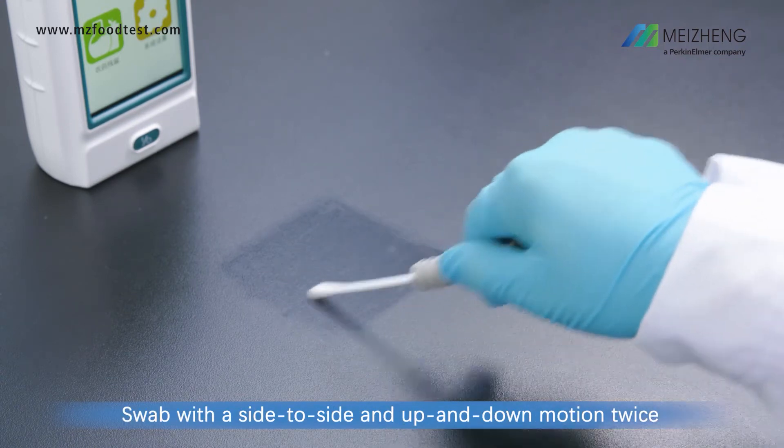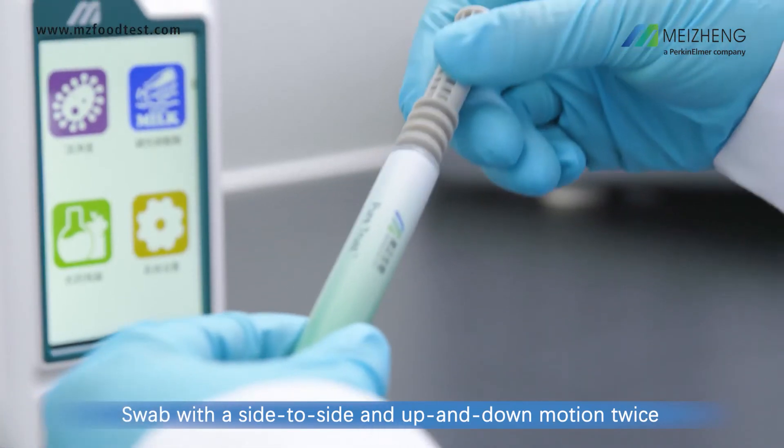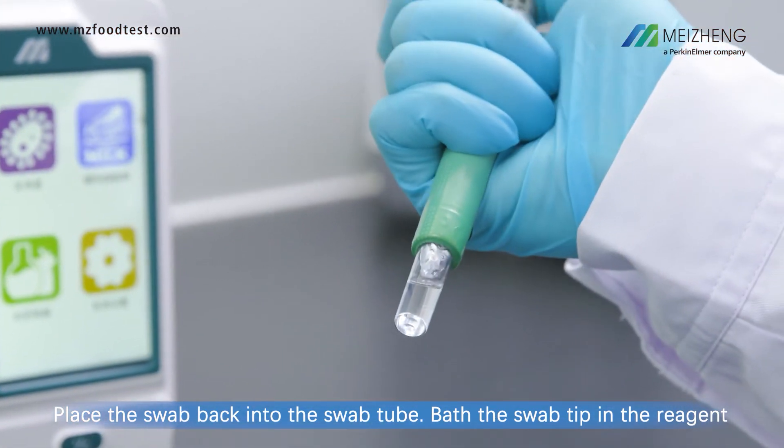Swab with a side-to-side and up-and-down motion twice. Place the swab back into the swab tube.